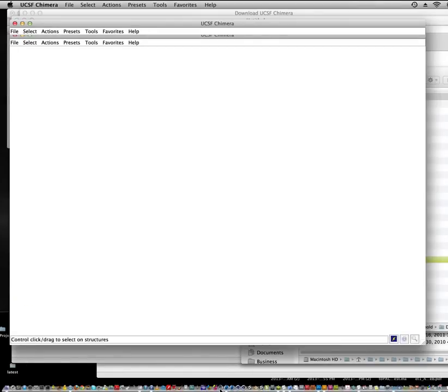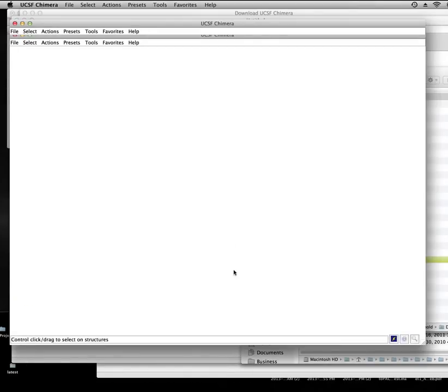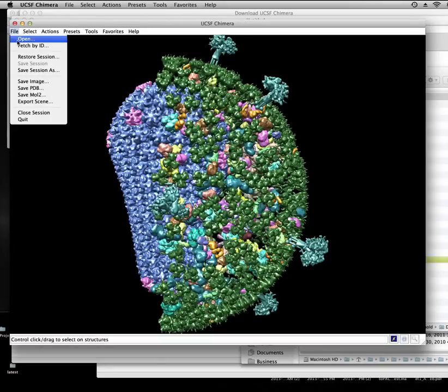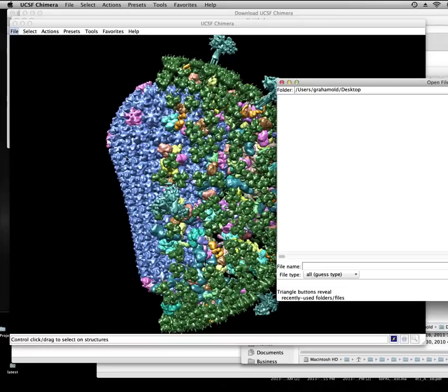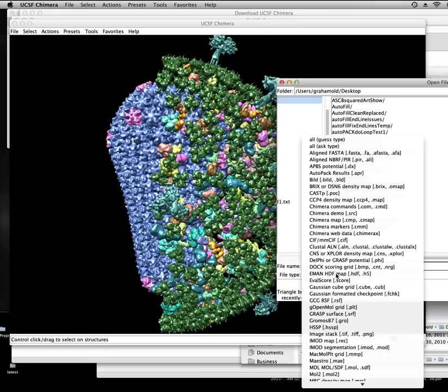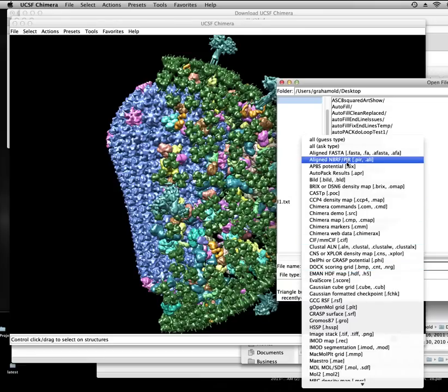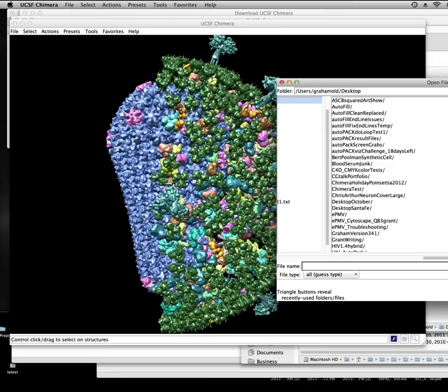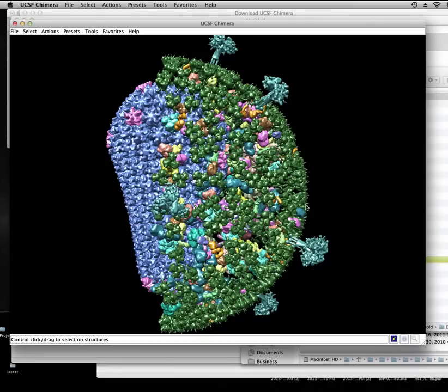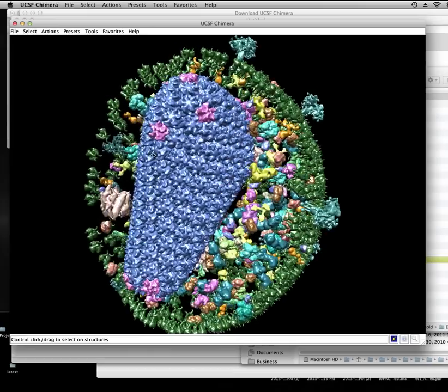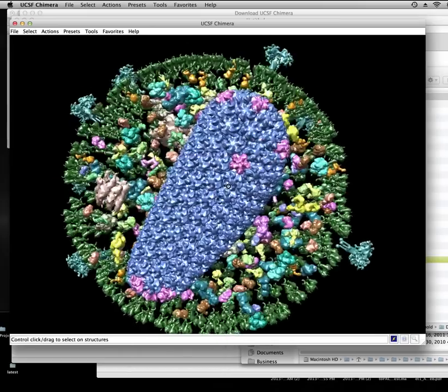You can just drag it into the actual application, or of course you can go into the application and click file open. If you want to filter by AutoPak result, that's the .apr file, and then navigate using this traditional navigation system to get to where you need to go.